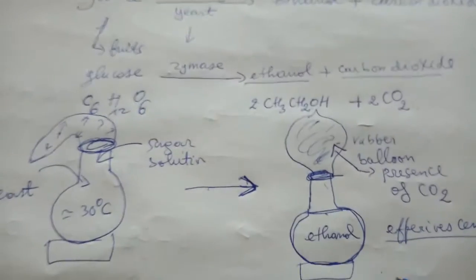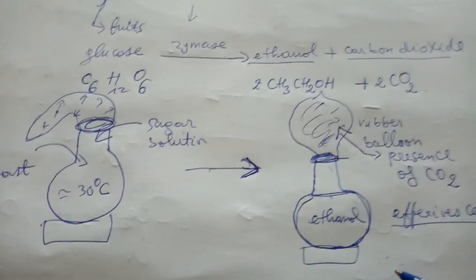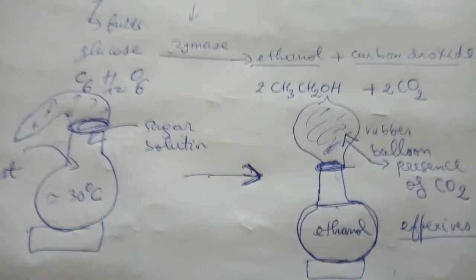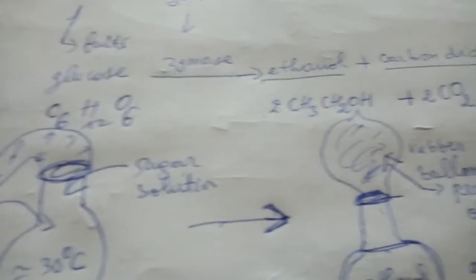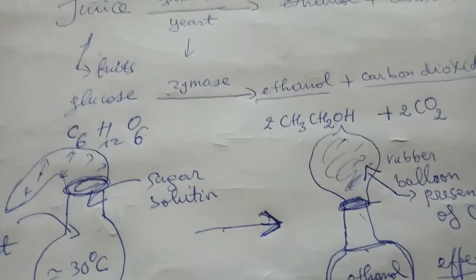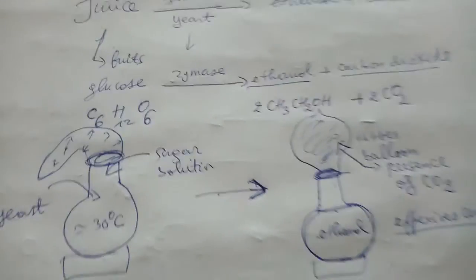You find that this is the practical activity which can help everybody to verify whether the fermentation occurred or fermentation is failing.